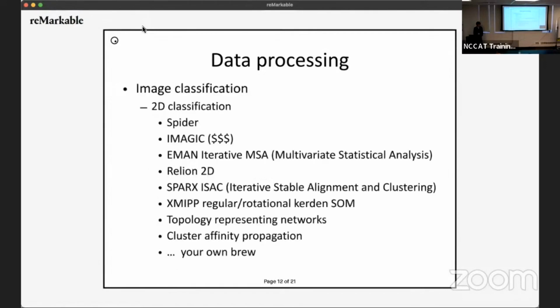Someone was taking a picture, so go slow enough that the picture can be taken. 2D classification is used a lot as a check and to remove some definite wrong stuff. It generally works very fast in cryoSPARC, and works well in RELION if you know how to tweak the resolution range at which you align your particles.